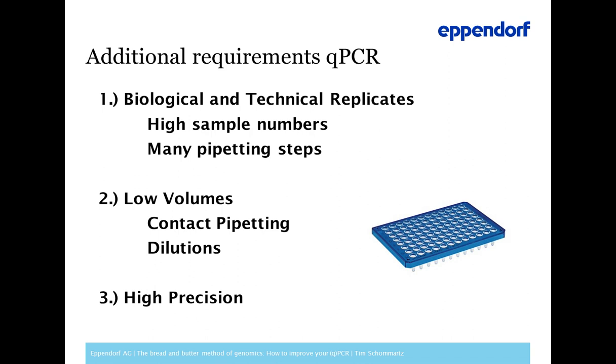Another option is to work with dilution. That would be my suggestion, so that you dilute your sample where you need a very low volume in order to get it to a dispensing volume which is handleable.